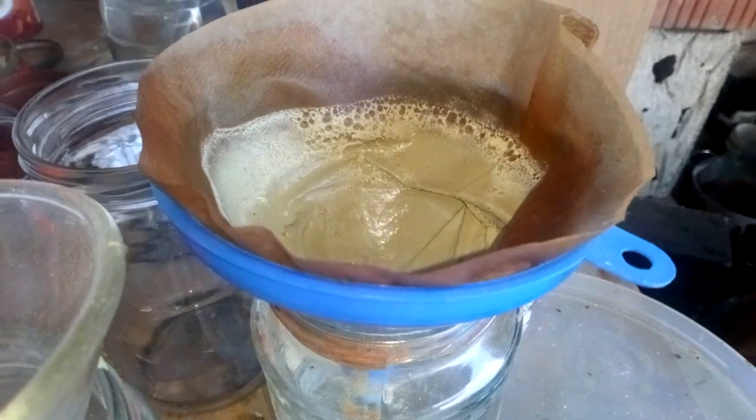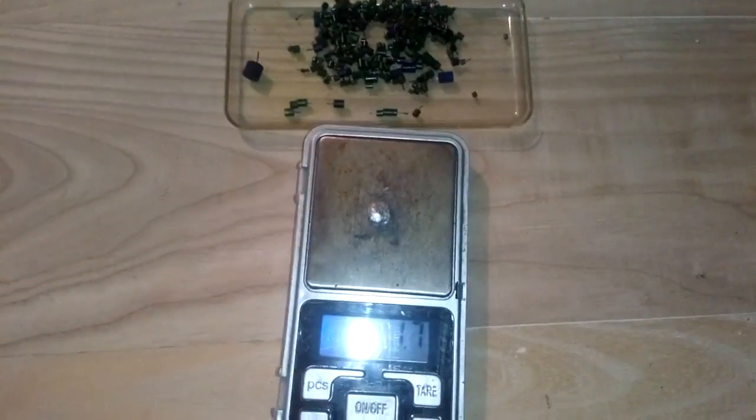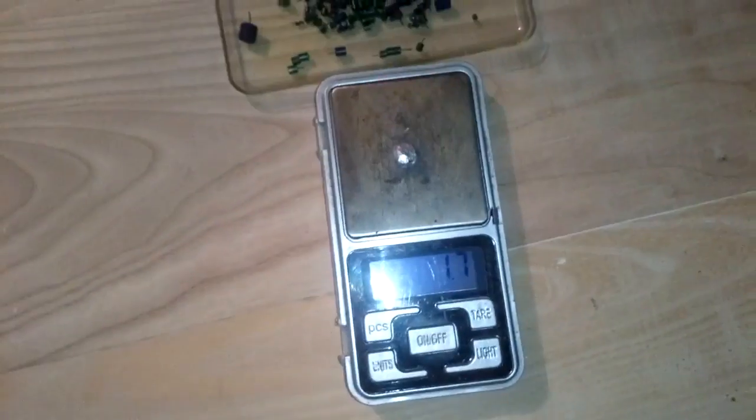Look at that — we got some silver chloride settling down. We still need to wait until everything settles, then we filter it, convert it, and see how much silver we have — not much, but we'll see. After converting that silver chloride and melting, we got 1.7 grams of silver. In my opinion, this kind of tantalum contains more silver than those in the metallic tube — except when the tube itself is made from silver.